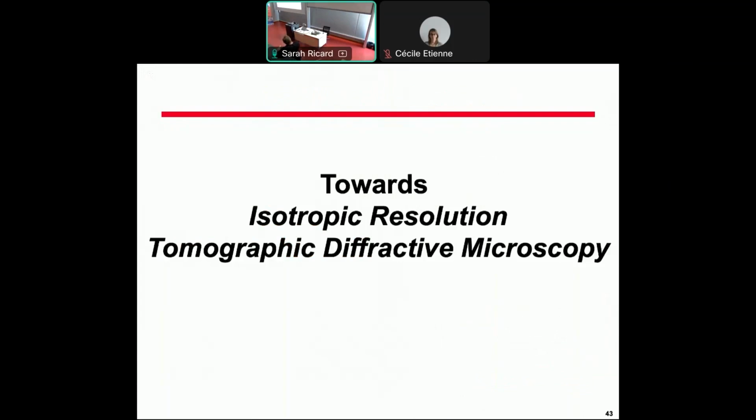How can we go to isotropic resolution? That is a big question in the domain because in fact, at the smallest scale, people are really hiding many things in the carpet. If you measure an index of refraction of a small droplet, which you see as a rugby ball and not a football, you may ask me many questions about the validity of the measurements. The object you measure is deformed. What are you measuring? So isotropic resolution imaging is really neglected, and I advocate this strongly.